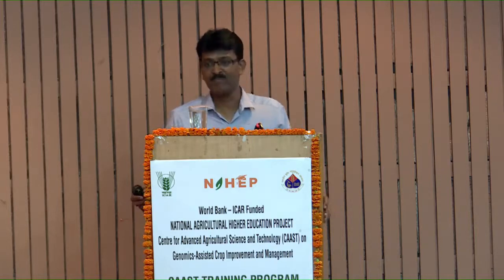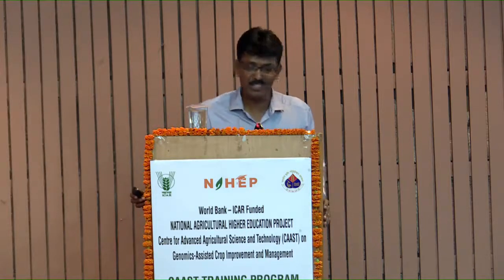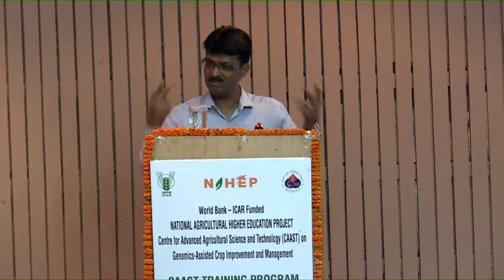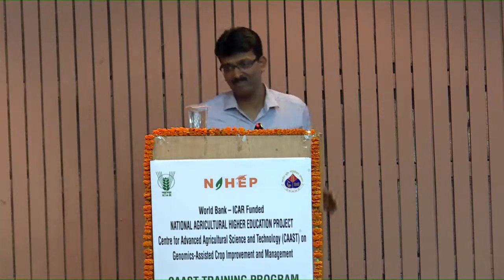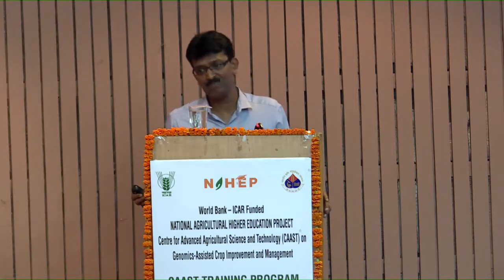In other terms, you are having two. Primer is also a probe only, if you think deep. Here you are going to use two primers for amplifying. The primer is going to mediate the amplification.